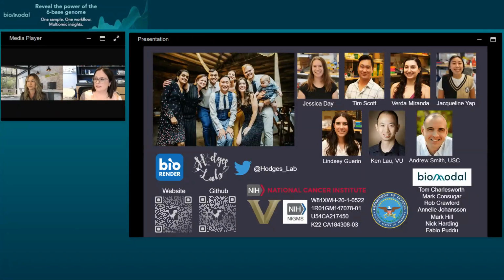Yeah, so let's just take a couple of the clusters that we observed to be closing. Many of them are regions that were once bound or initially bound by pluripotency factors. So a lot of these regions might be enhancers in the embryonic stem cells that eventually get closed or repressed when the cells transition to neural progenitors. So they're no longer being actively engaged by transcription factors. So that would be my guess.